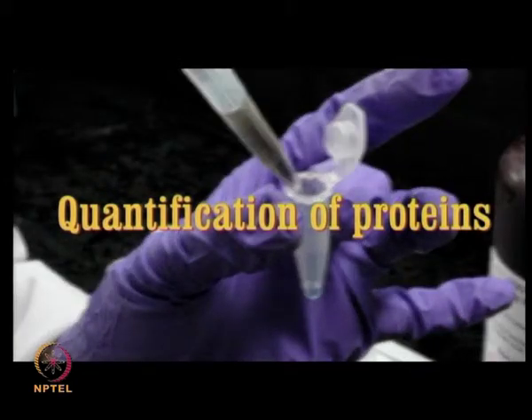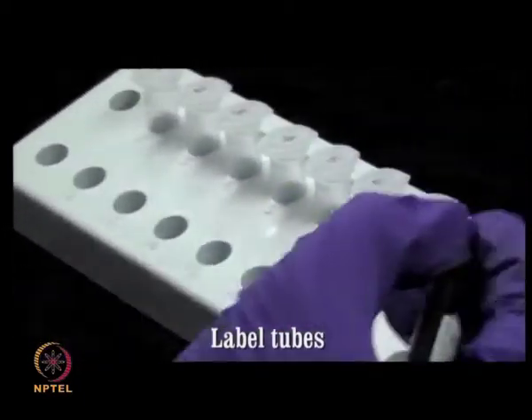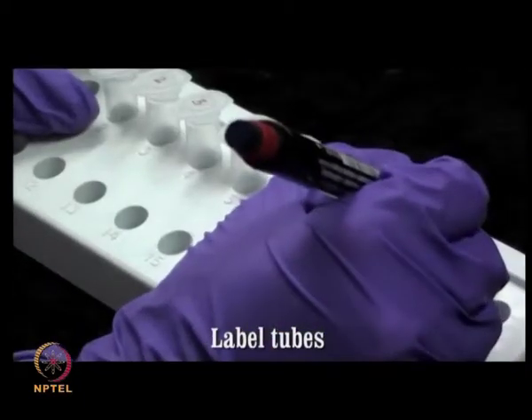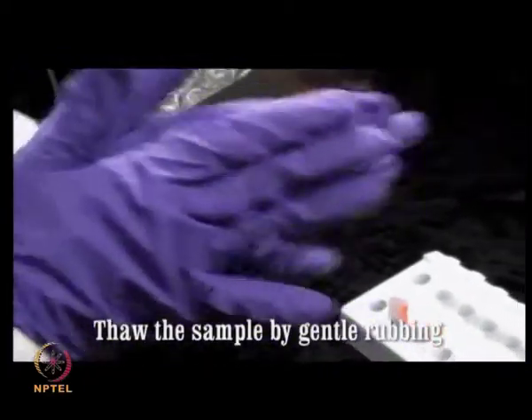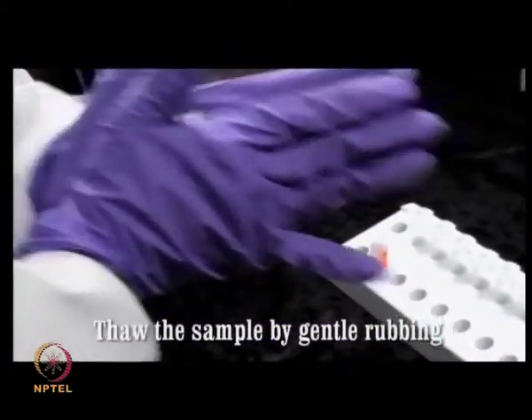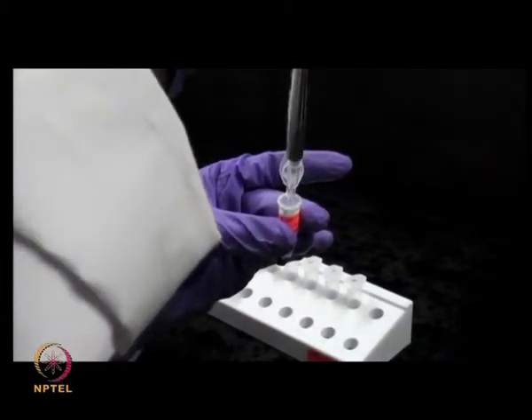Quantification of proteins. After the protein sample has been extracted from its source, it must be quantified to determine the protein content before any further processing. Label the tubes suitably for standard and test samples. Thaw the protein sample to be quantified by gently rubbing it between the palms. Prepare the sample buffer required for diluting samples during the assay and mix it well.